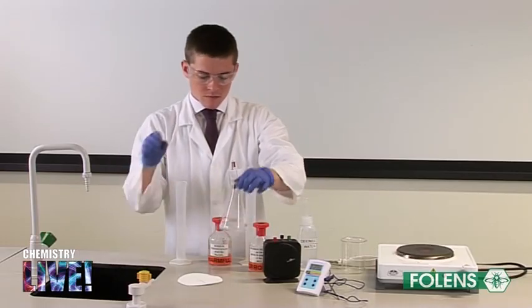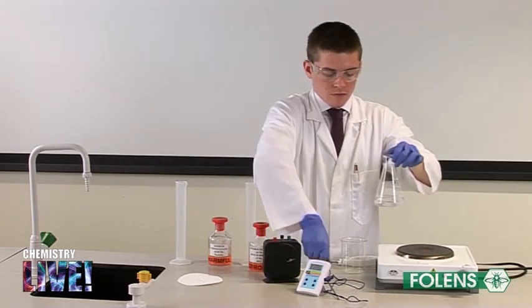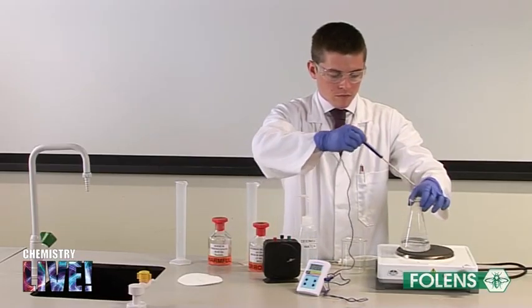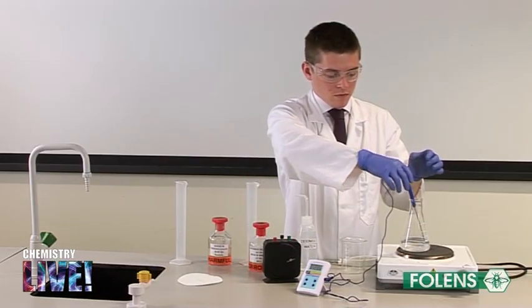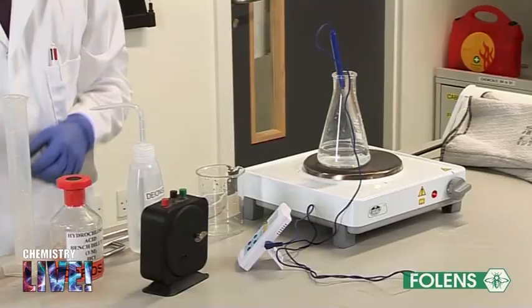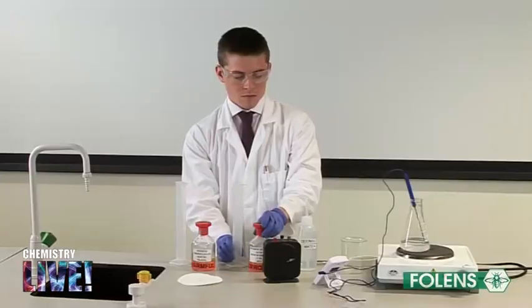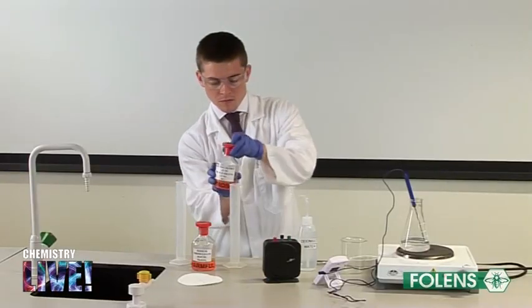Warm the flask using a hot plate or a Bunsen burner to a temperature of about 30 degrees Celsius. Warm a beaker containing 10 centimeters cubed of hydrochloric acid to the same temperature.